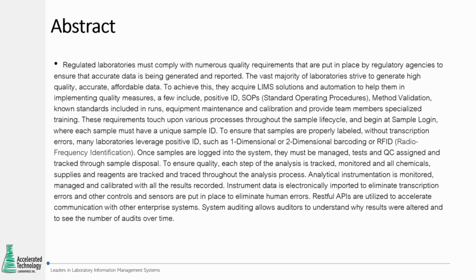and also managing other things in the laboratory that contribute to quality, such as employee training records, instrument maintenance, calibration, repair records, the ability to link standard operating procedures into the system and control those SOPs, as well as keeping track of the chemicals and reagents and supplies that are in the laboratory. So there's so many functions that a laboratory is responsible for, and the LIMS is a software solution that allows a laboratory to best utilize their resources in terms of time spent on tracing and tracking all of those variables.